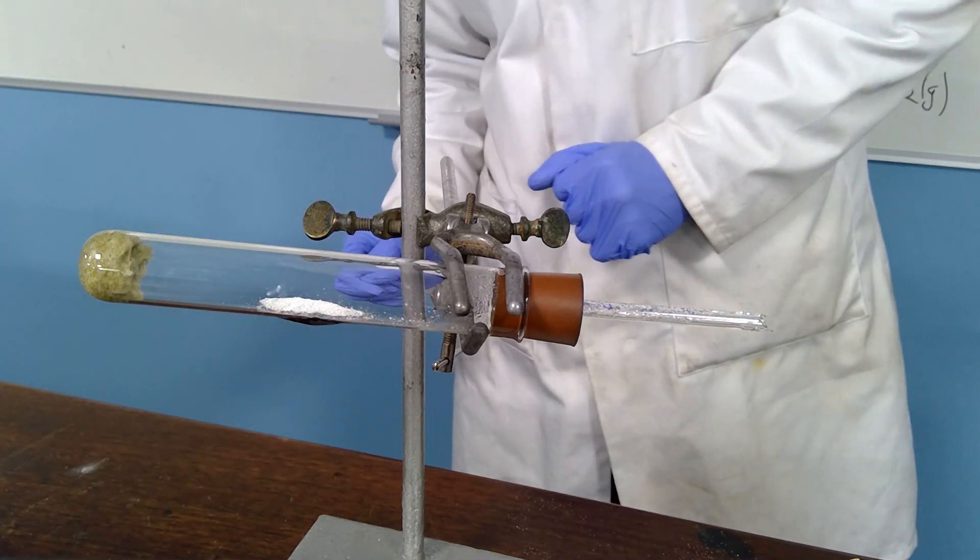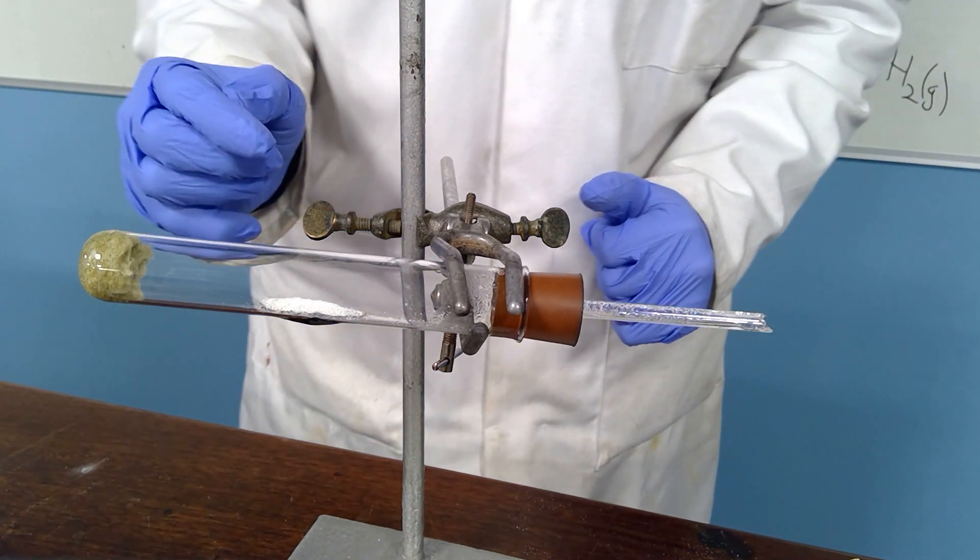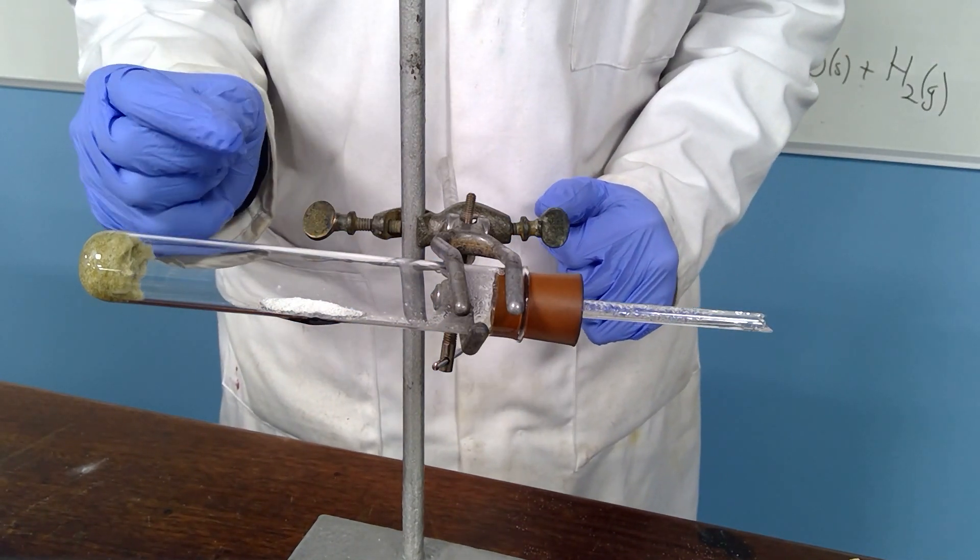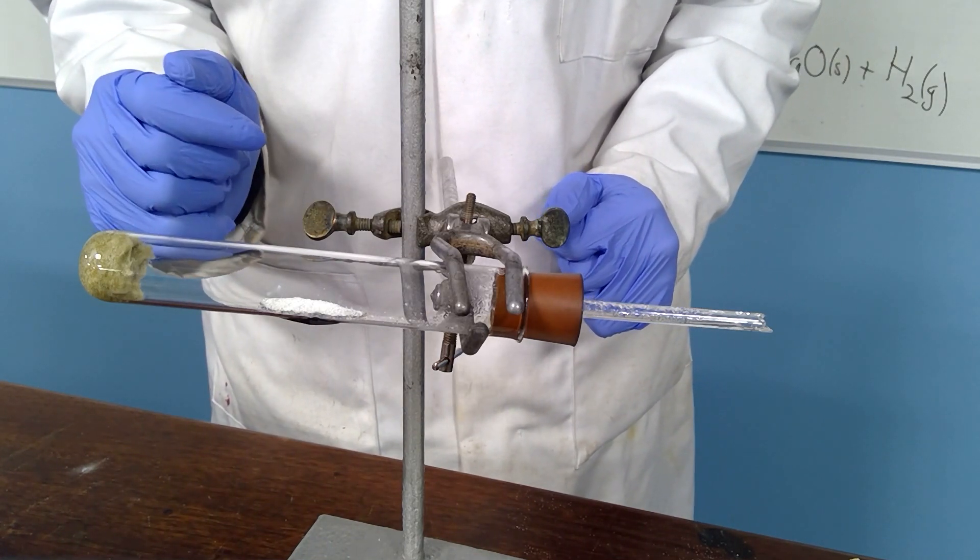You will see that the boiling tube may have slightly changed shape where the very hot magnesium has reacted and has slightly melted the tube.